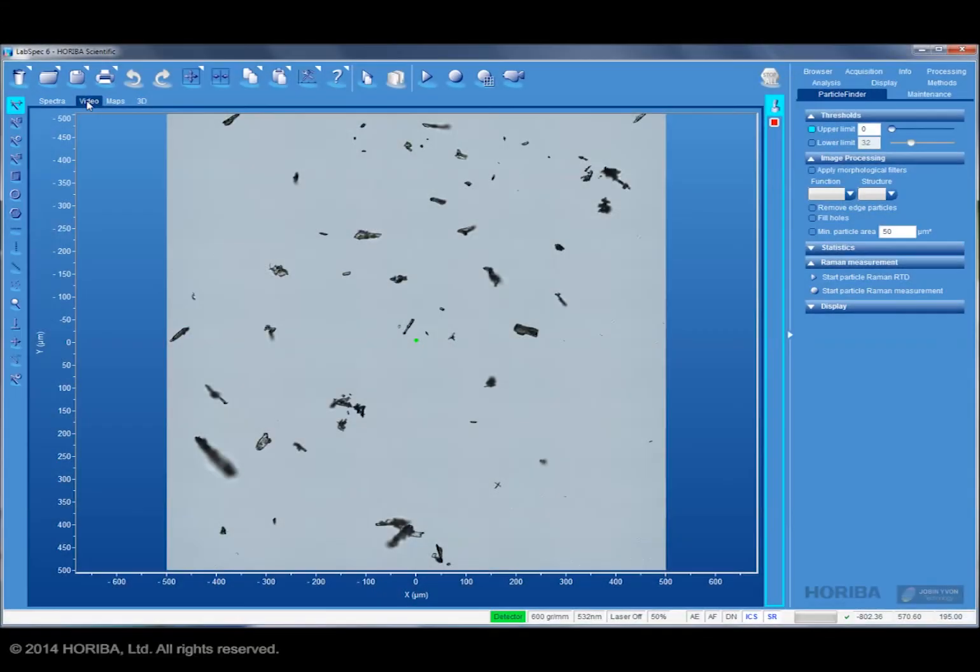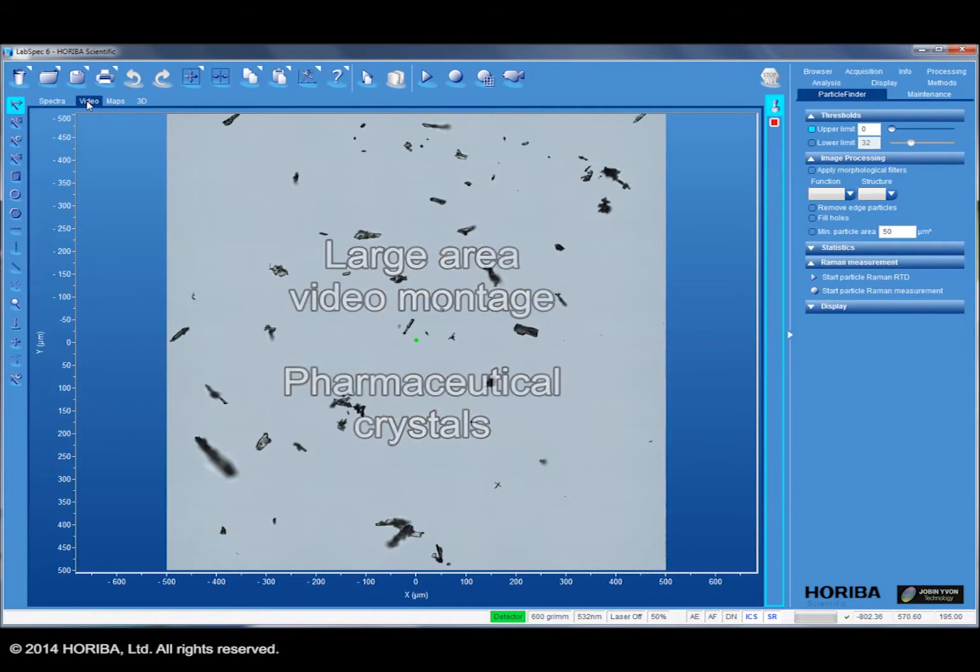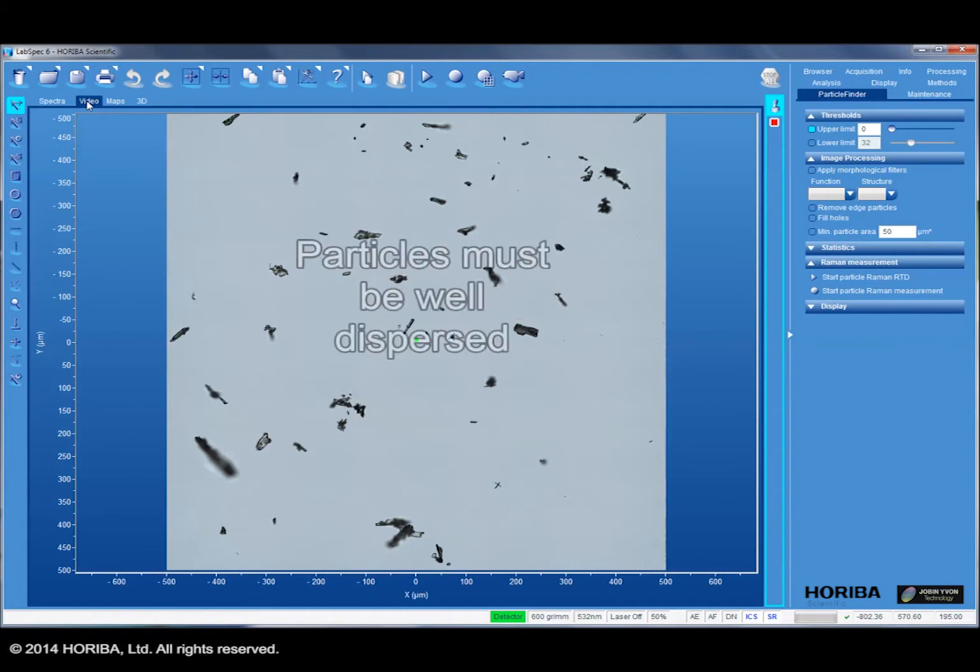In this example, a montaged 1x1mm image of pharmaceutical crystals has been recorded. The crystals are well dispersed on the slide, which is a critical requirement for image-based particle analysis like this.